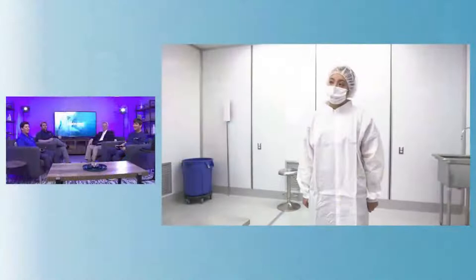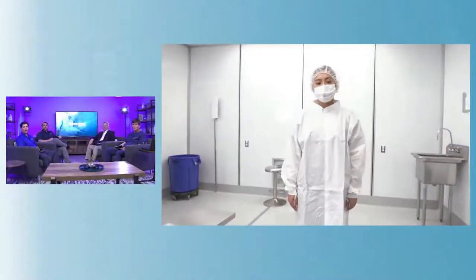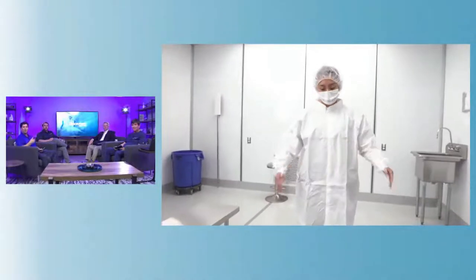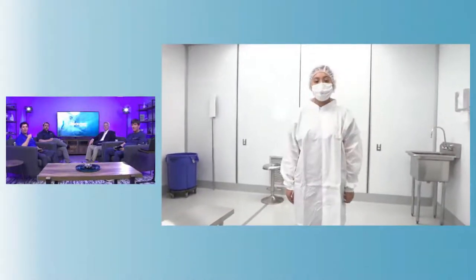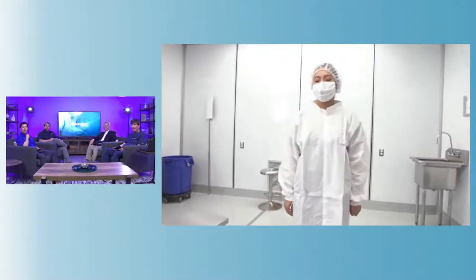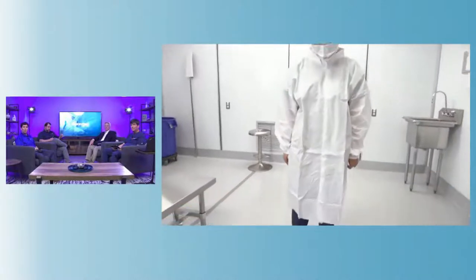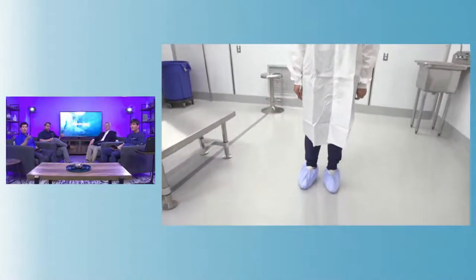But we do have Christine over here in the clean room wearing what we recommend. She's got a microporous laminate frock on. It buttons down from the top to the bottom, and it also has a mandarin collar, so it protects anything coming out of the neck and also any exposure from your clothes. And if you go down to the shoe covers, she's also wearing some recommended shoe covers, and I'll talk about that in a second as well.